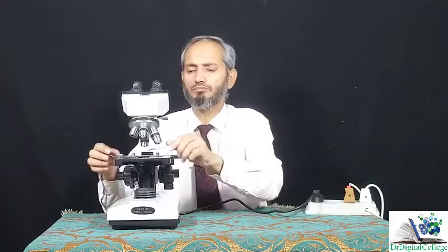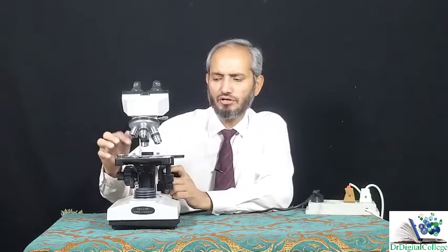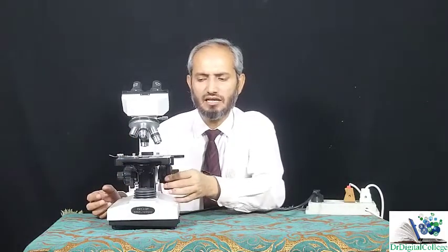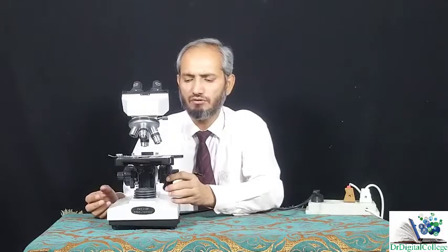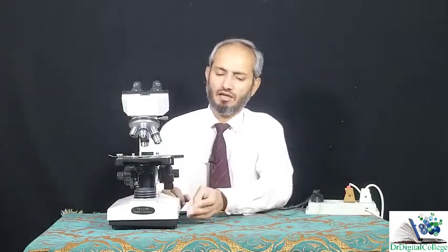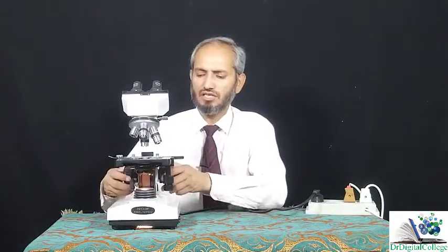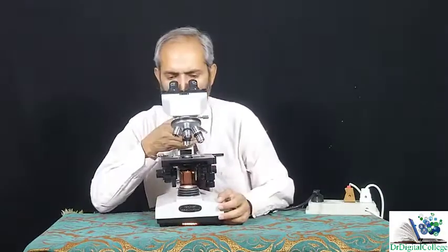So you will use a specific method of focusing. What is the routine method of focusing? First you put your slide over here, you move your stage right, left, forward or backward like this, and you fix your object exactly beneath this objective lens. Now you will switch on the light. The light is switched on. And now the stage should be at the lowest position. I have moved this stage to the lowest position. Now you will be observing it through the binocular like this.